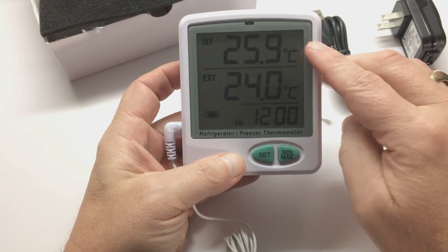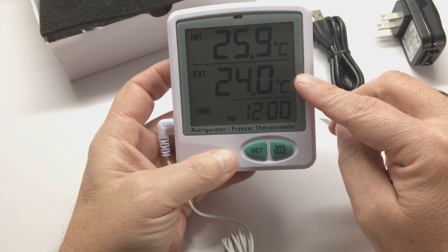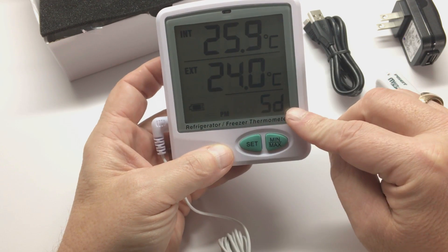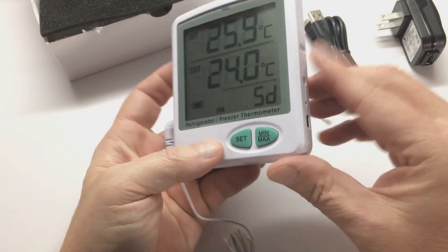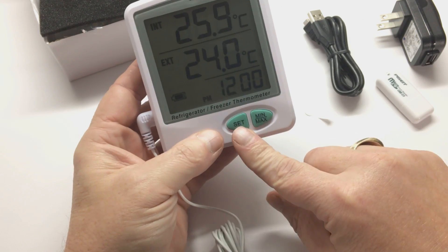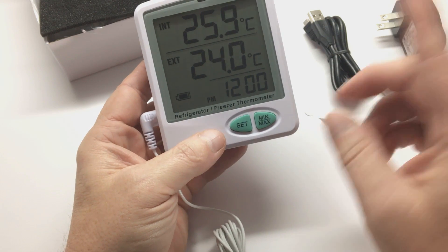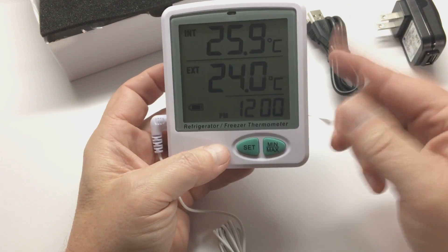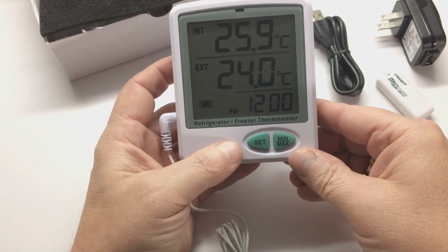A quick overview: at the top you have your internal temperature, the middle is your external temperature, and below you see the time and SD, meaning that the SD card is installed. The Set button is for setting your min and max alarm set points and time, and the min-max button is for your screen, which will be shown a little later.